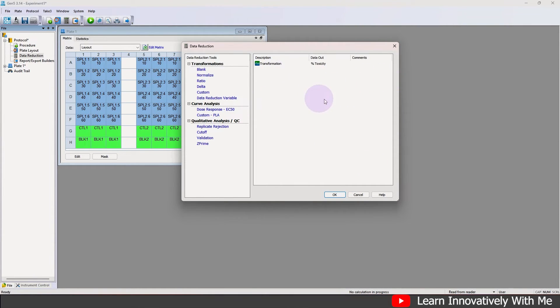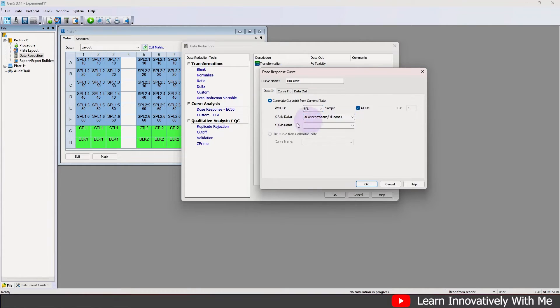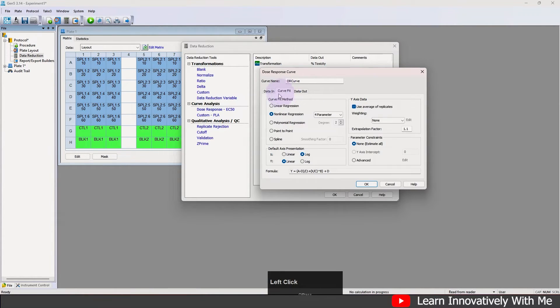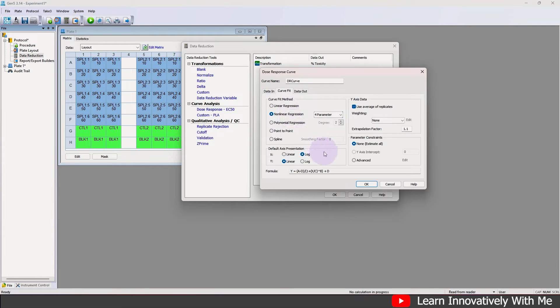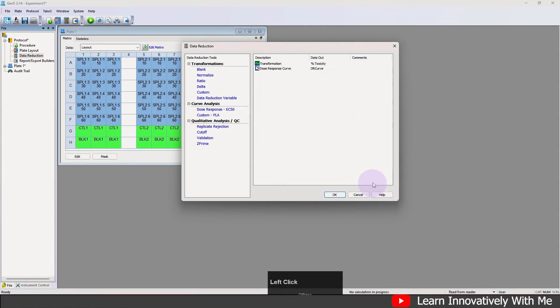Next, assign the standard curve. You can use the response option to set up the curve. Data in: X-axis is concentration or dilution; Y-axis, select toxicity. Click 'Curve Fit' — four-parameter nonlinear regression is already selected, so I won't change this. Data out: response at 50 percent. Click OK. Up to this point we have set the procedure, plate layout, and data reduction.